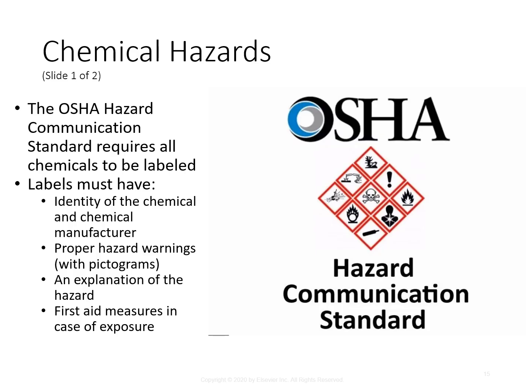Some of them have a flame, some have a skull and crossbones. That gives you a brief overview of what this chemical is capable of. It also should have an explanation of the hazard, and it should also have first aid measures in case somebody is exposed to this chemical.